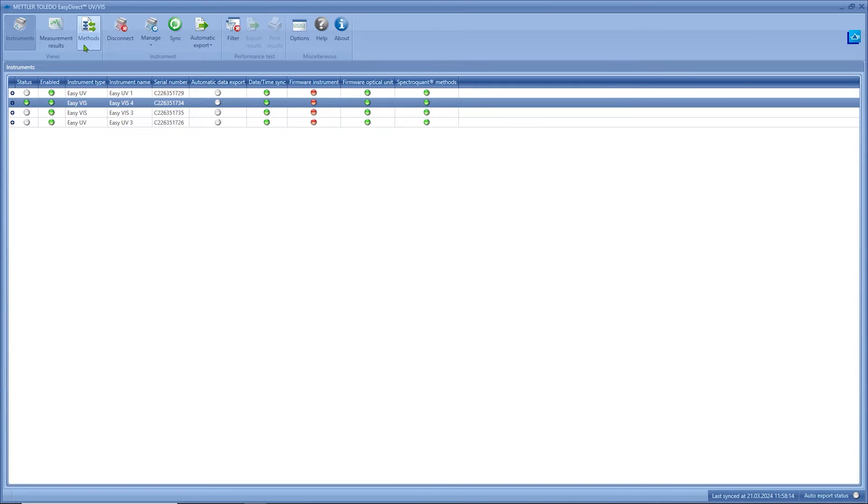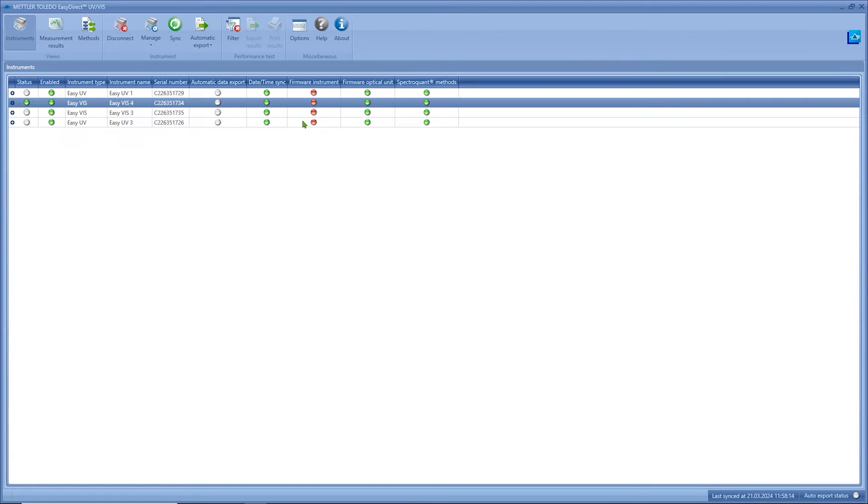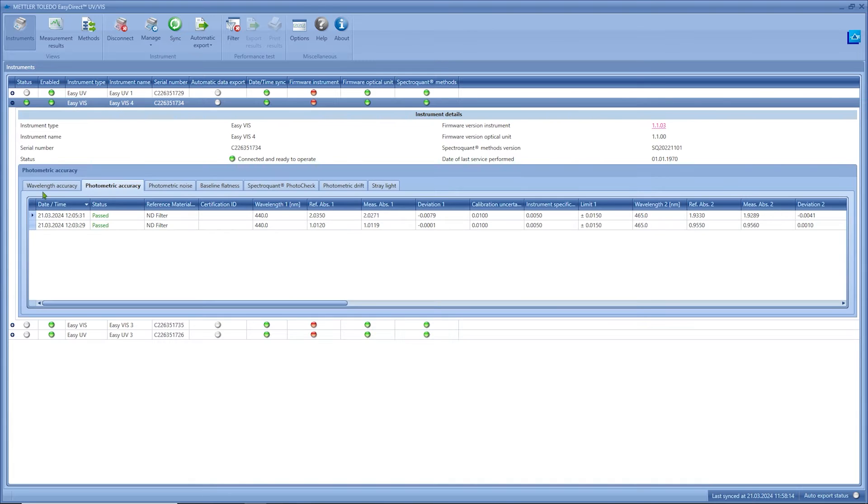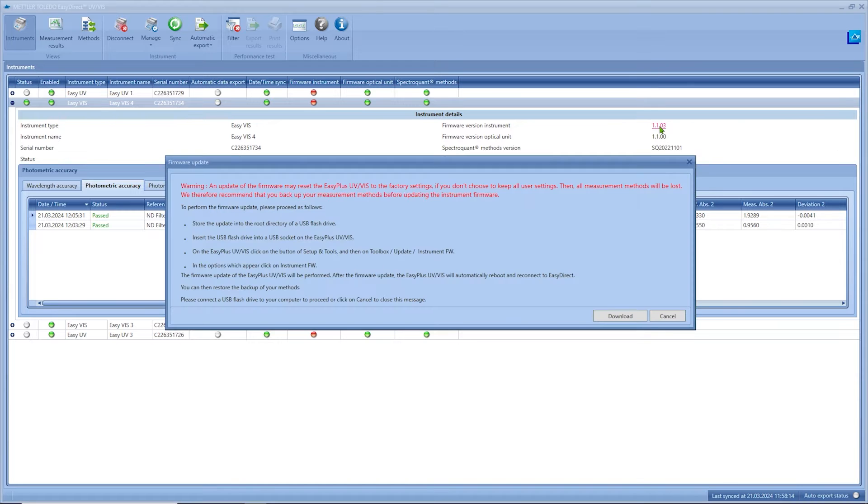Below instruments you can see your list of connected instruments, their firmware status, and the results executed performance test methods. If the firmware of your instrument is outdated you can download the latest version via EZ Direct to a USB flash drive.